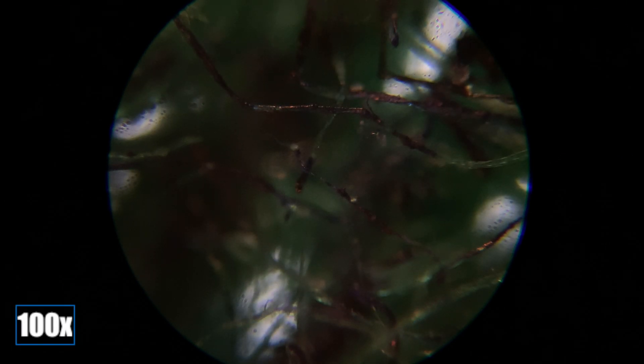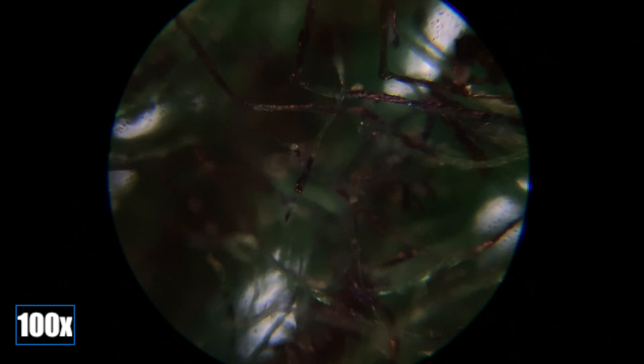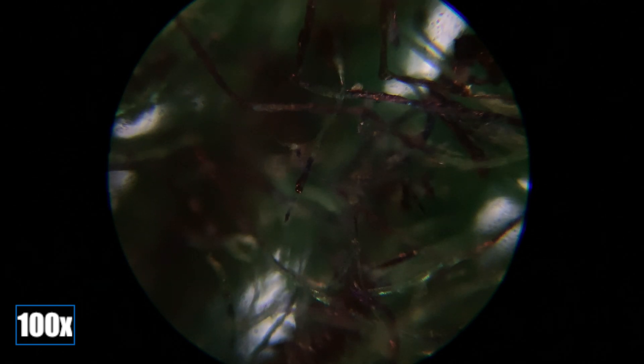The cotton is dyed green in the case of my shirt. The fibers were dyed green, much the same way that the pin ink stains the cotton fibers blue, or what you may see as black.